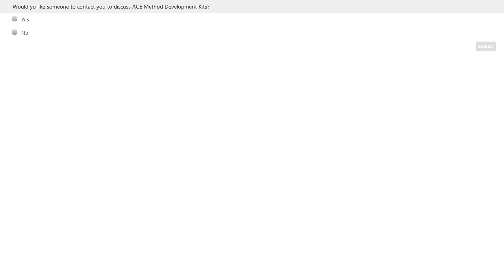A question that came in early on, referring to one of your earlier slides. Someone asks that they've always approached development by addressing chemistry prior to physics. That is, the type of stationary phase and the organic solvent choice, before things like considering temperature, gradient profile, and column dimensions. This person believes that the physical parameters may have more predictable outcomes. It seems that you've listed these as third and fourth in your experiments, and the person asks why.